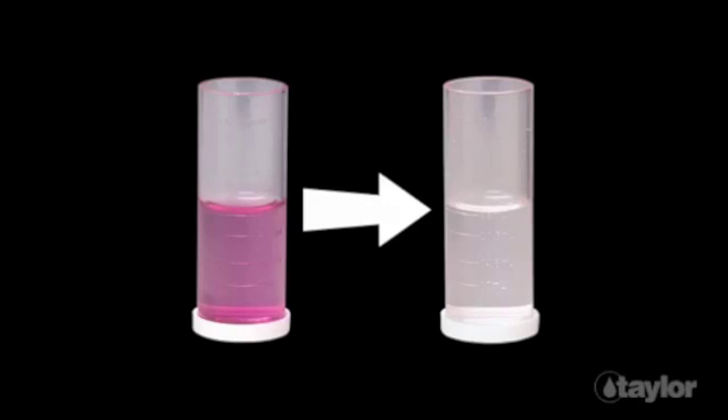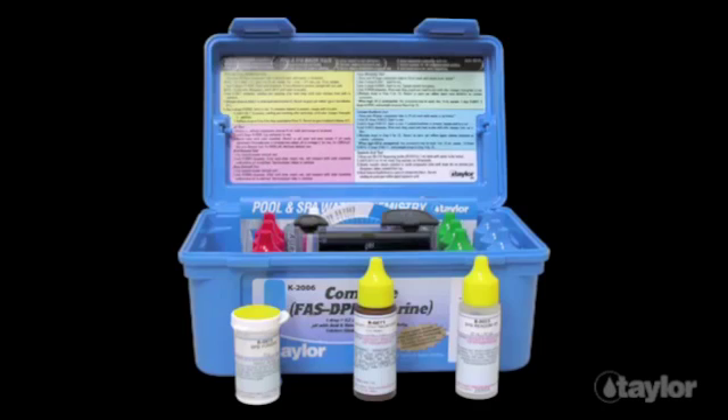And the distinct change in the treated water sample from a color — pink — to no color is easy for everyone to see. The tests in the K2006 complete kit include FAS DPD titration to measure free and combined chlorine.